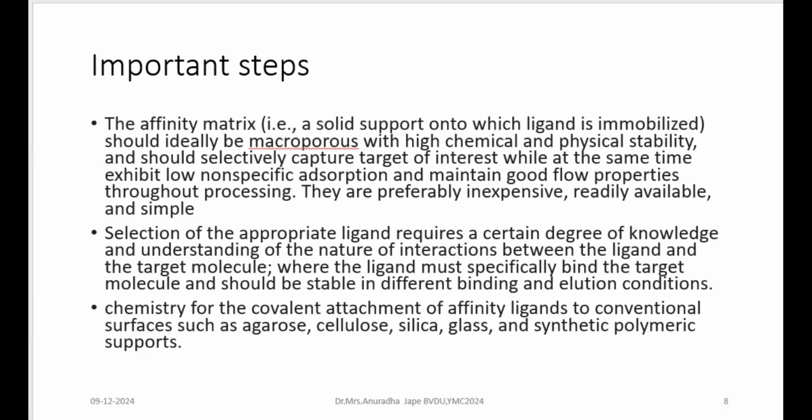Otherwise, when you are putting this ligand onto the support matrix, if the functional groups or the important charges get locked, that is, if they interact with the support matrix, agarose, dextran, silica gel, whatever matrix you have chosen, and get blocked, the entire functionality may get compromised.